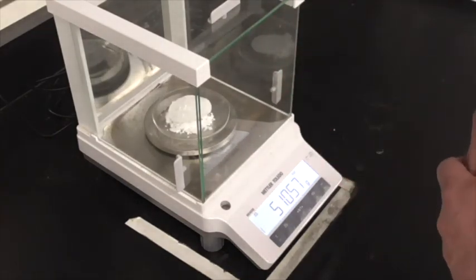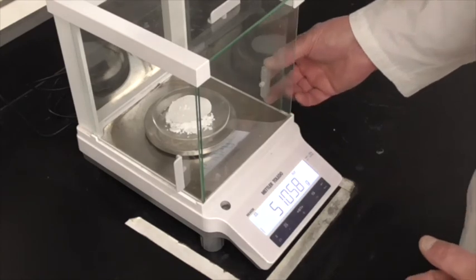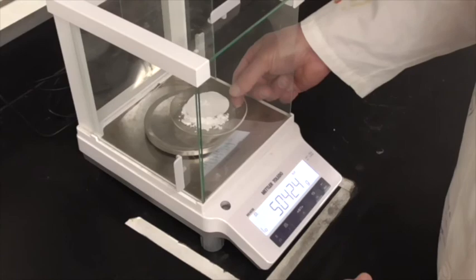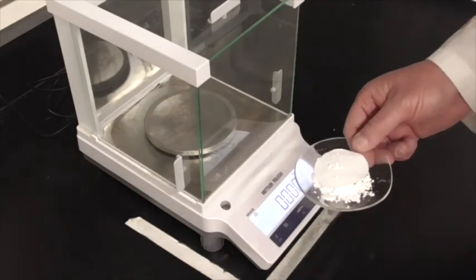So the mass of the watch glass, the filter paper, and the aspirin at the end is 51.058 grams. So now we can figure out our percent yield. Remember, we need to subtract off the mass of the watch glass and the filter paper. So now we'll go test the purity of our product.